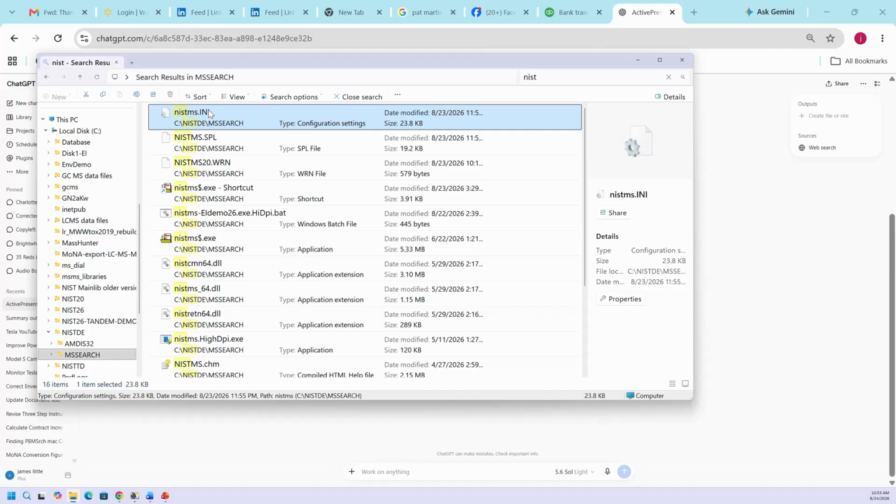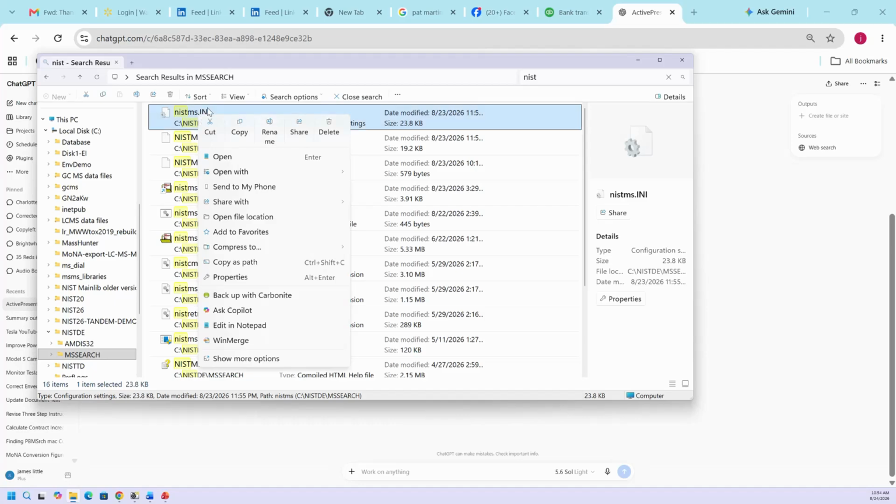We will point to them being in that folder that I just showed you, and it talks about that in the handout. But if you want to change it at a later date, because you want to change where your libraries are, or you really pointed to the wrong place, then you can edit this ASCII file. Again, it's an INI file configuration wise, so don't change that. But you can open with Notepad and you can change where the library is located or where the software expects it to go. So these are pretty much the basic operations.